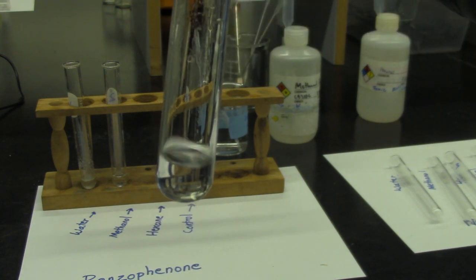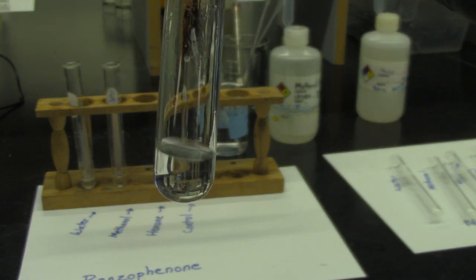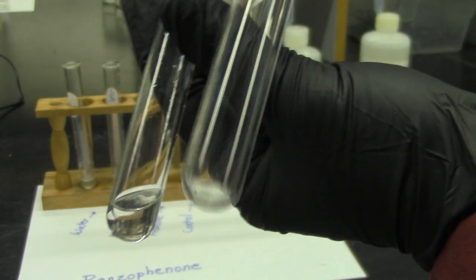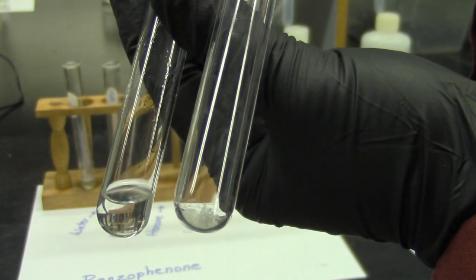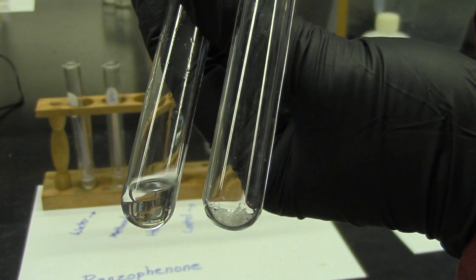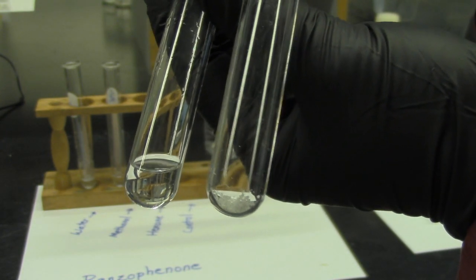I've added 1 ml of hexane into benzophenone. Write down the observation. Compare with test tube number 4, which is the control, just solid benzophenone, and determine if benzophenone is soluble, insoluble, or partially soluble.